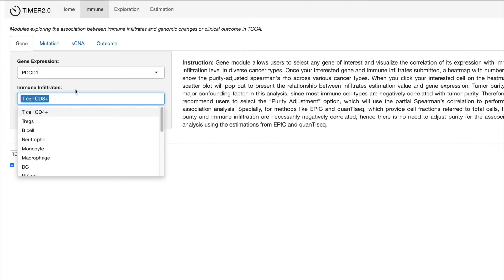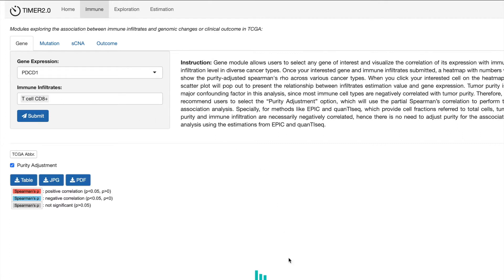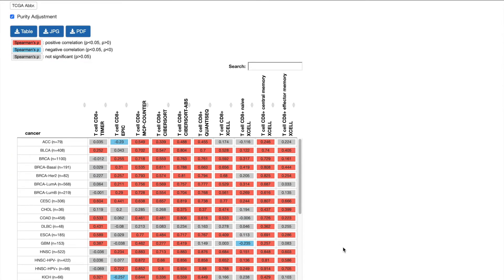Taking CD8 T cell as an example, TAMR2 will output a heatmap where each row is a different cancer type and the column represents CD8 T cell infiltration estimated by different algorithms, like TIMER, EPIC, etc. The value in this heatmap is the partial Spearman correlation between PDCD1 expression and CD8 T cell infiltration level. Red color indicates significant positive correlation, and blue color indicates statistically significant negative correlation.